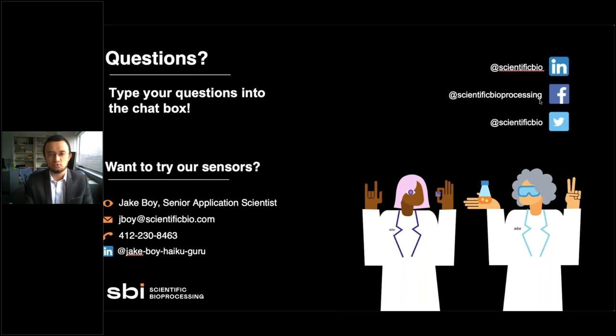And that relates to the question that I answered previously about the potential applications for gastroenterology and the boom of microbiota research that's happening right now. So that's our main application at this moment. But not only that part of the interaction between colonic epithelial cells and microbiota, but also what goes after that interaction. So their interaction with stromal cells like fibroblasts and with vascular cells like lymphatic endothelial cells are also one of our interests.